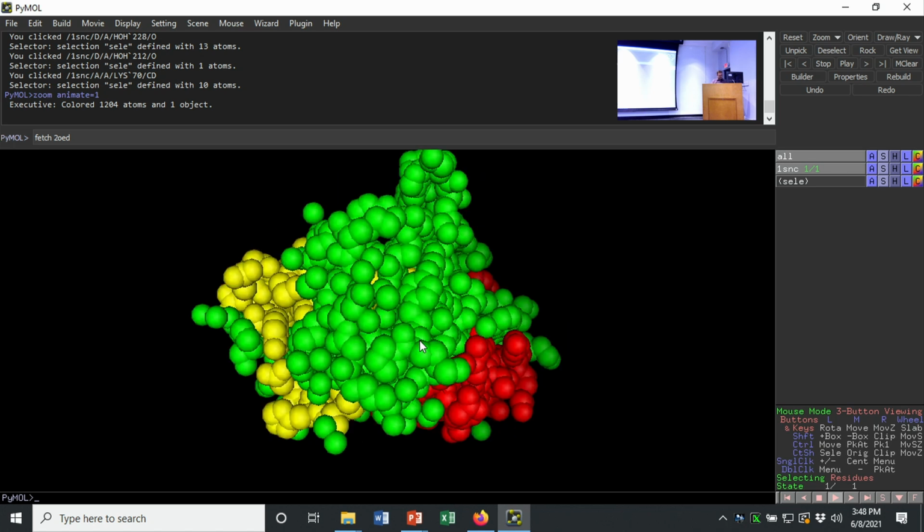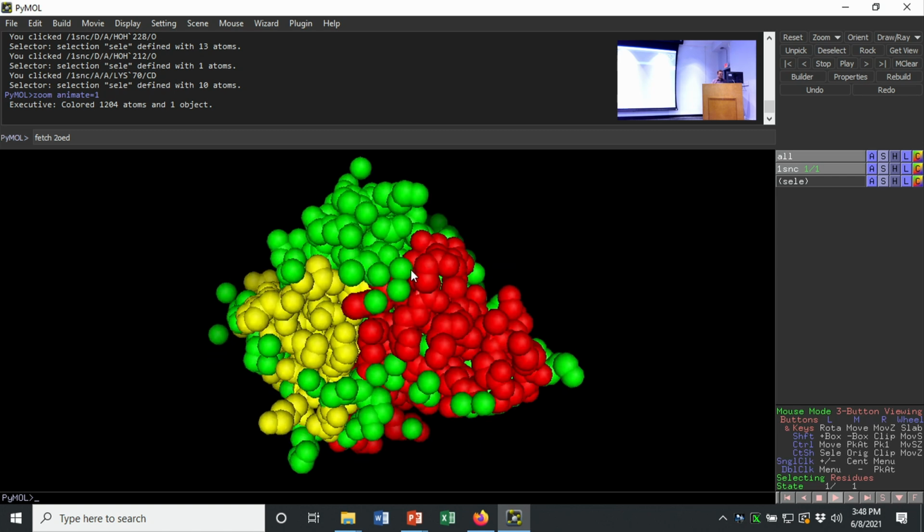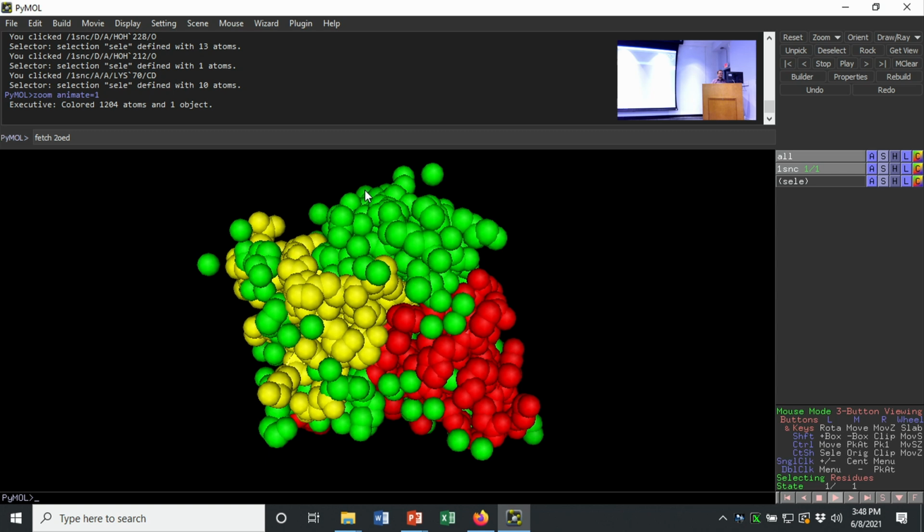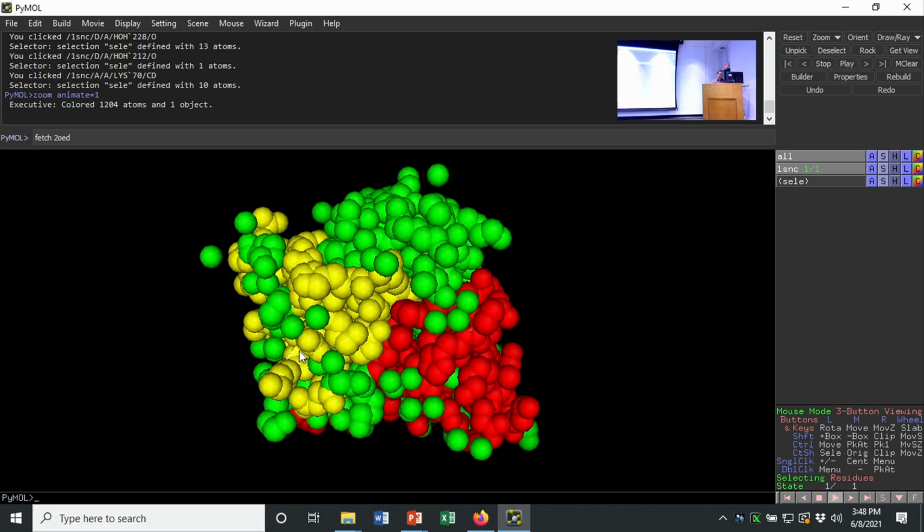And if you were to talk to Bertrand Garcia Moreno, he'd say that this has a definite correct orientation. I think this would be it. But anyway, here you can see where it's colored by secondary structure.